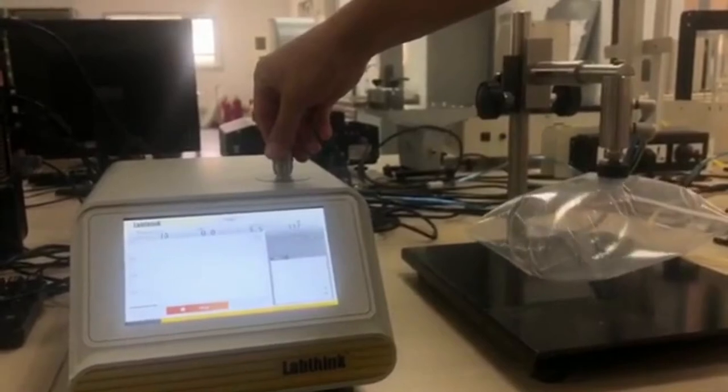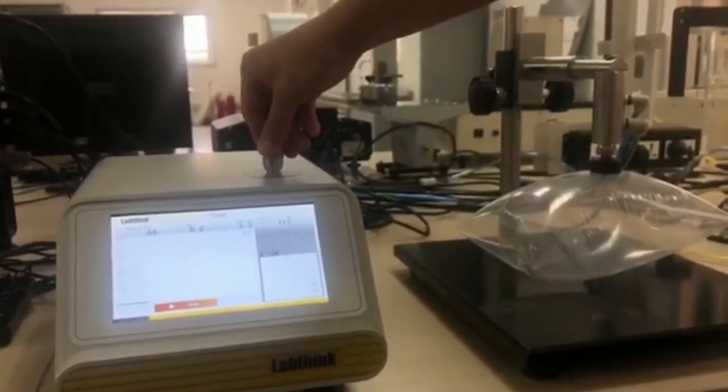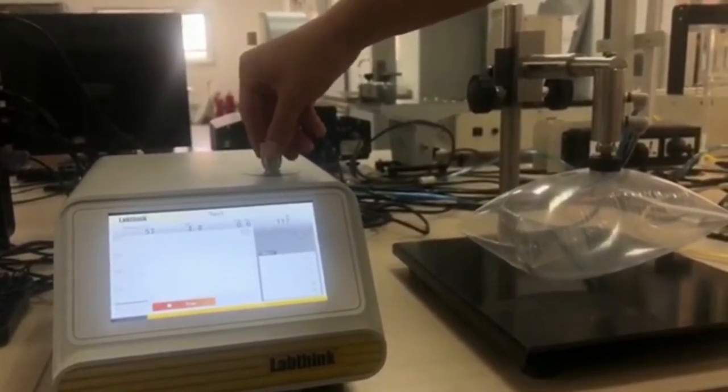By turning it clockwise, we can increase the flow rate.